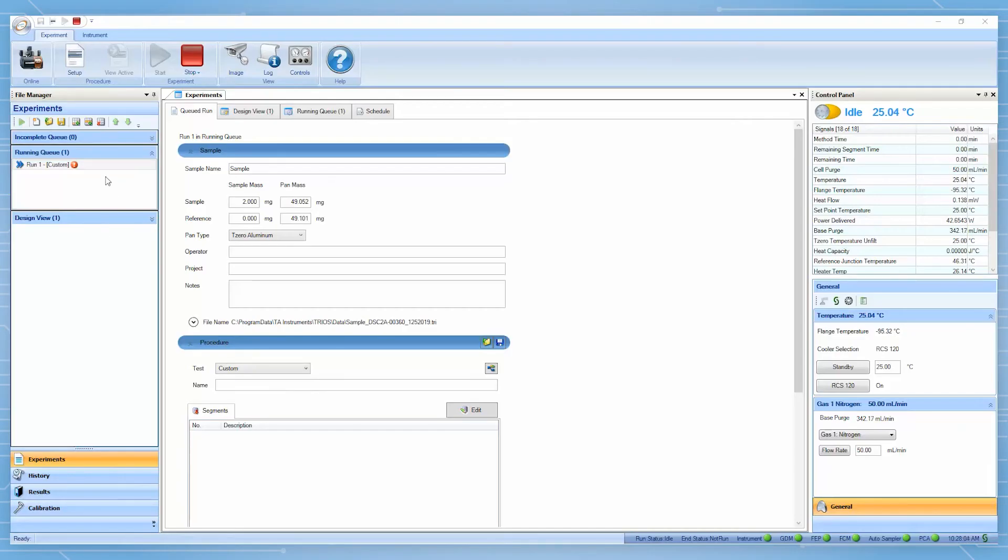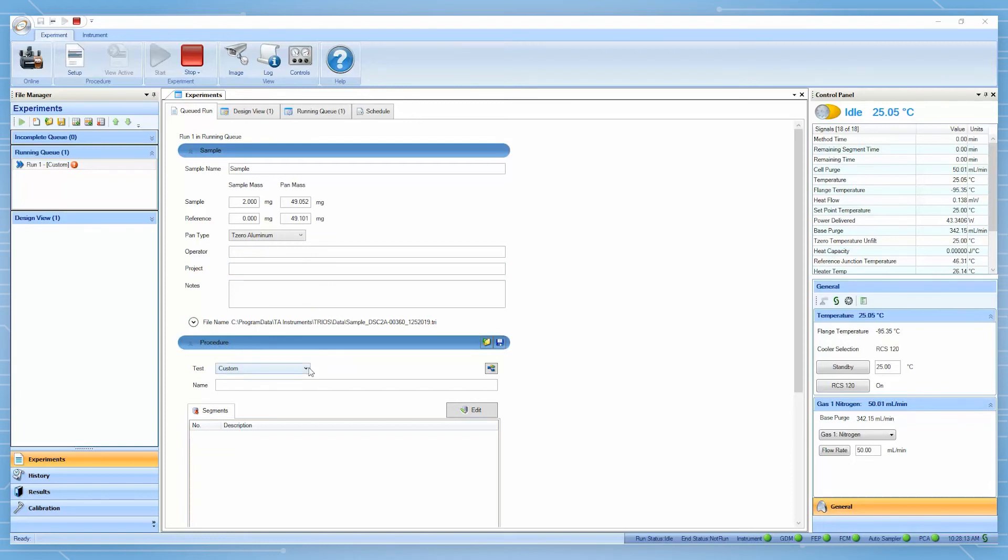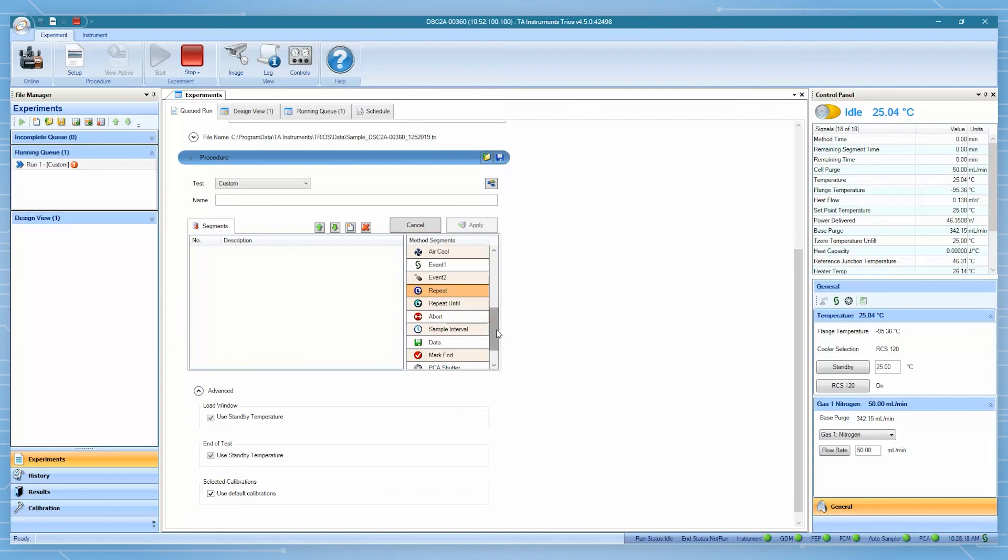To perform a PCA experiment, first input the sample name, sample and pan mass, select custom test in the procedure filter. Equilibrate at the temperature of the desired reaction temperature. Isothermal 2 minutes for a stable baseline.